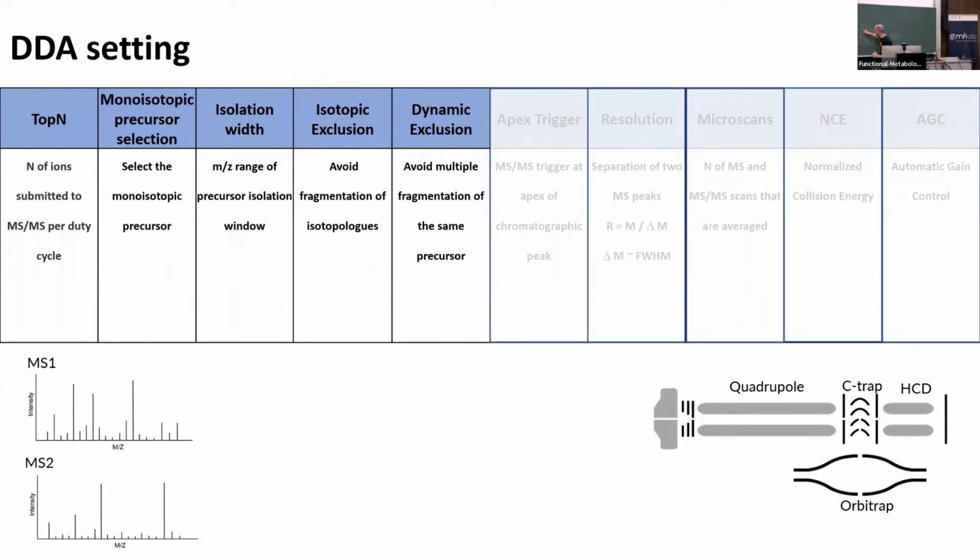Ideally, that should be at the top. That we get to at the next one, but yeah, over and over triggering of the same MS/MS is basically wasting scans. And this becomes very bad when you have one massive feature that is a peak from the beginning to the end of your chromatogram, and you waste, I don't know, 20% of your MS/MS events just on that, because in every duty cycle, it's triggered. So dynamic exclusion prevents that.